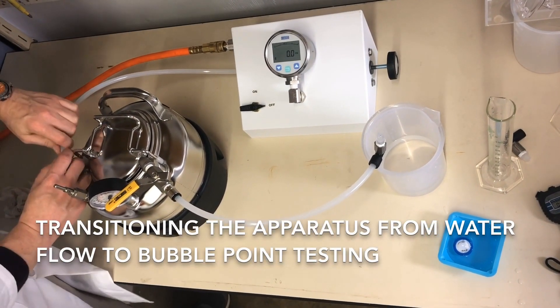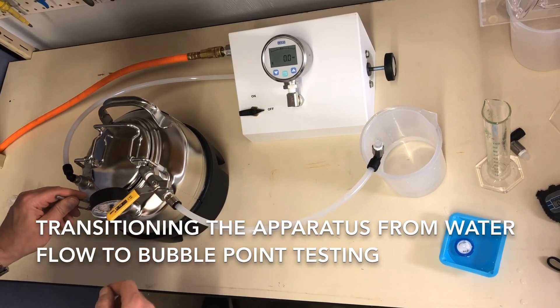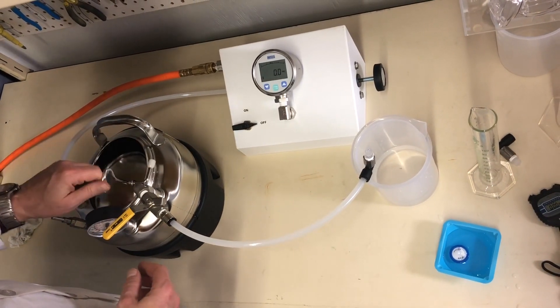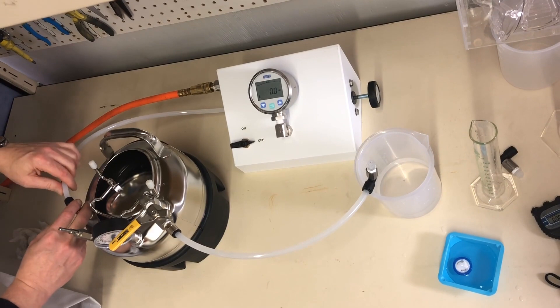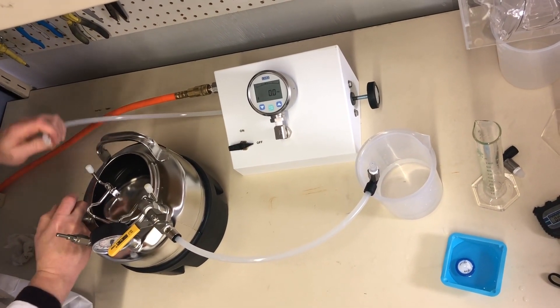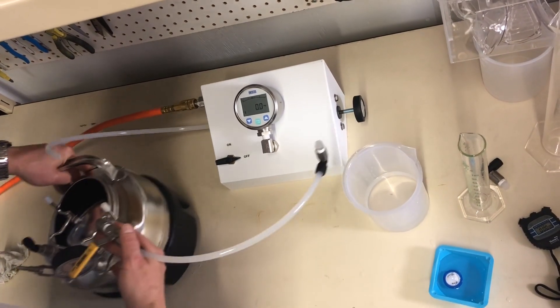We'll disconnect the pressure pot. We'll make sure that everything reads zero so we're safe. We'll open the lid just to make sure that there's no pressure in there. Then we disconnect the pressure line by pulling on the flange towards the fitting and then pulling the tube out. We can safely move the pressure pot out of the way.